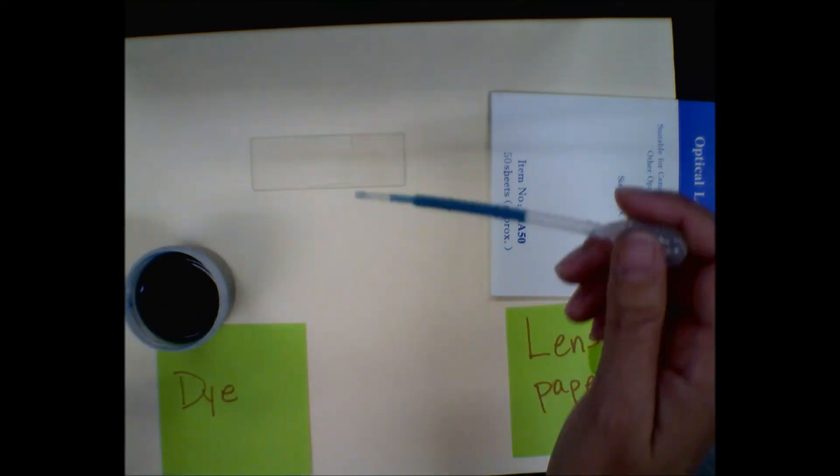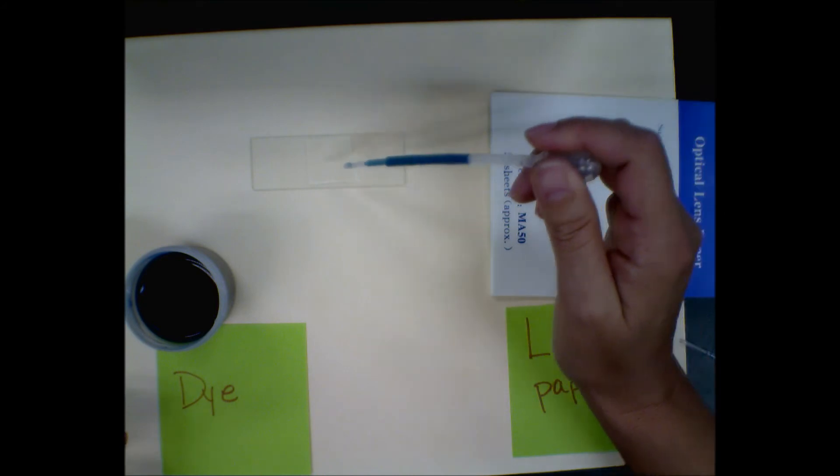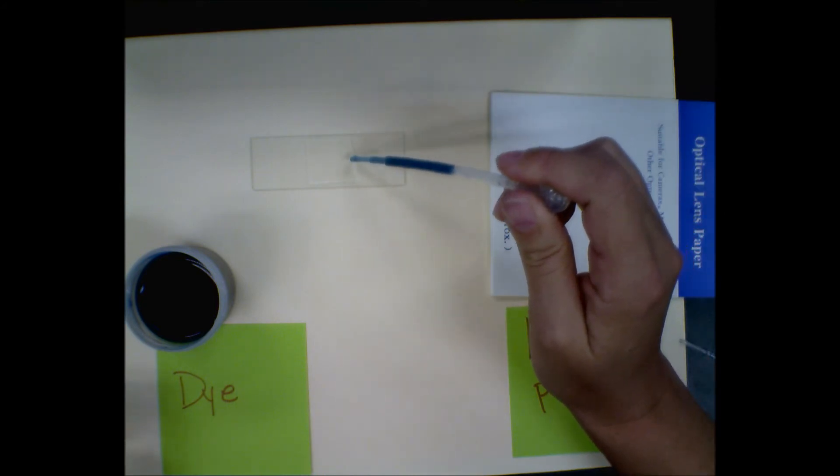Next you just put a drop of dye at the edge of the cover slip. You don't put it underneath the cover slip because then it'll get too dark.